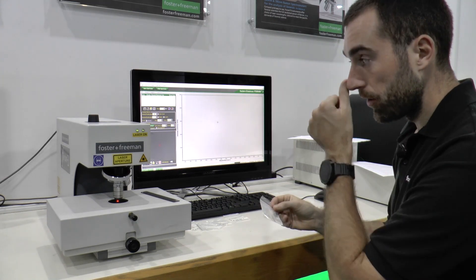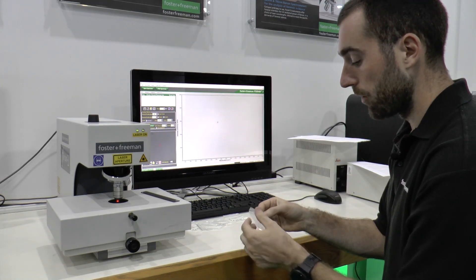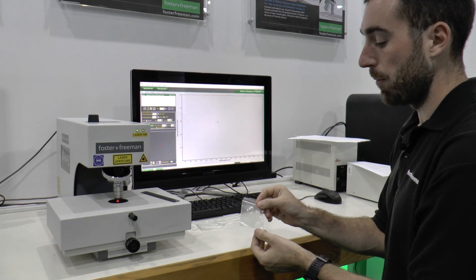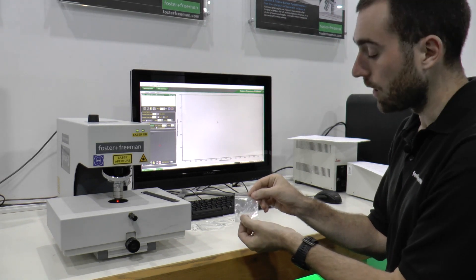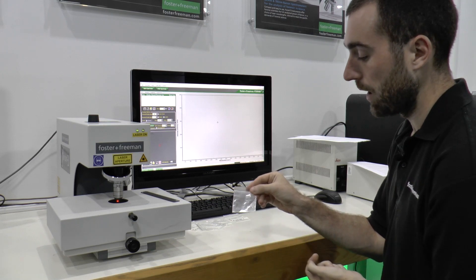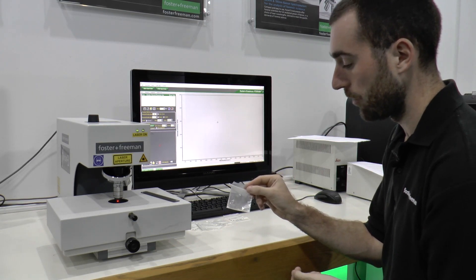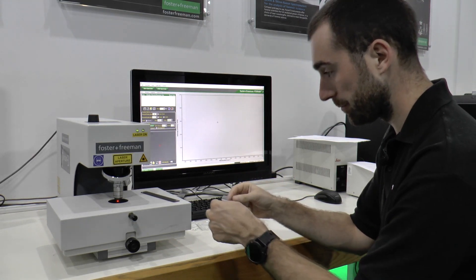One of the advantages of Raman spectroscopy is that we are able to take measurements through clear plastic bags such as this, so we do not need to remove the powder from the actual bag itself.